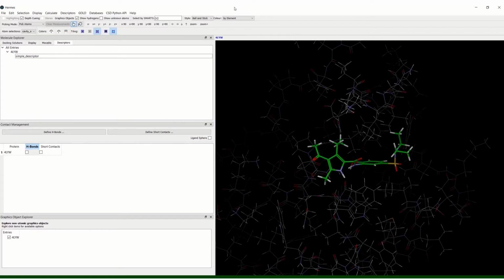In this video, I'm going to tell you how to set up descriptors in Hermes. Descriptors are chosen to quantify molecular features. The descriptor you define can be then calculated for a library of docked ligands, and the complete set of descriptors can be saved for future use.